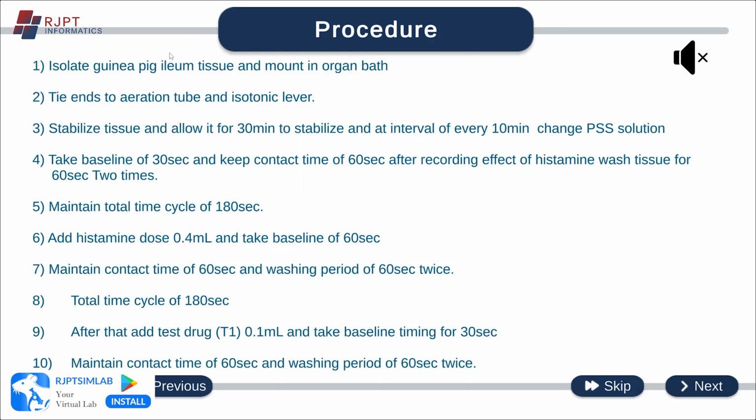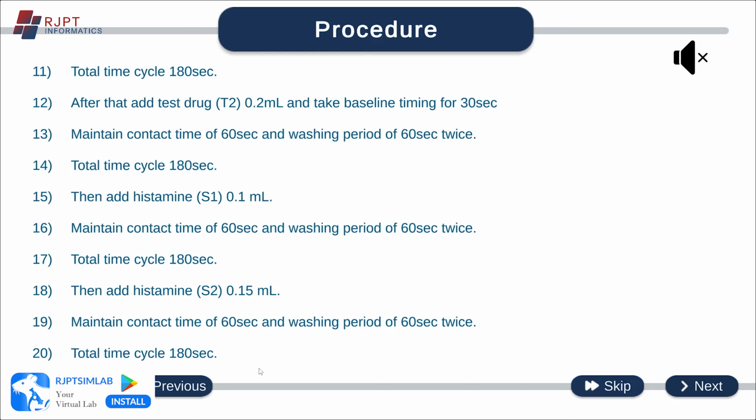Now let's see the procedure. These are the steps according to which we'll perform our experiment. We will discuss these steps while performing the experiment. Here we have 20 steps to perform.